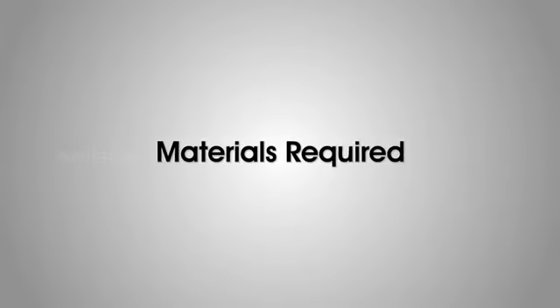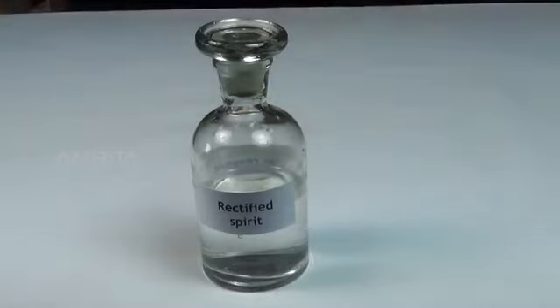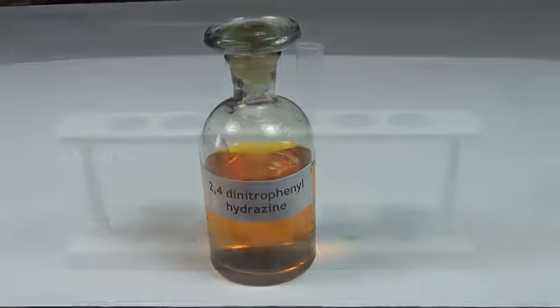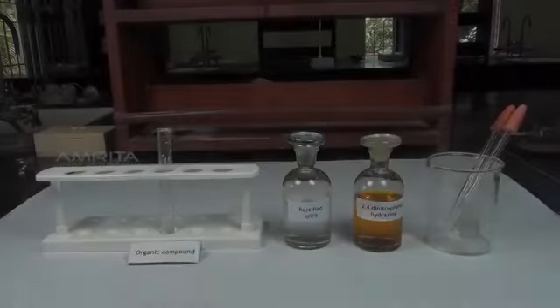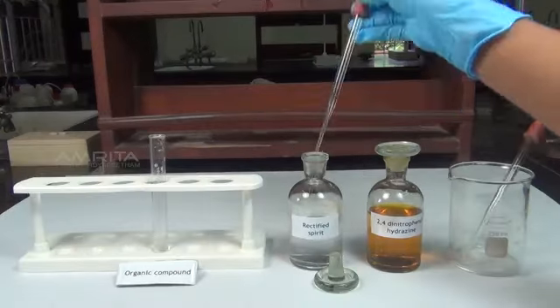2,4-dinitrophenylhydrazine test. Materials required: organic compound, rectified spirit, 2,4-dinitrophenylhydrazine solution, test tube and droppers. Procedure: take a small quantity of organic compound in a test tube.